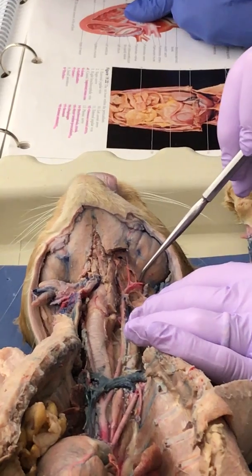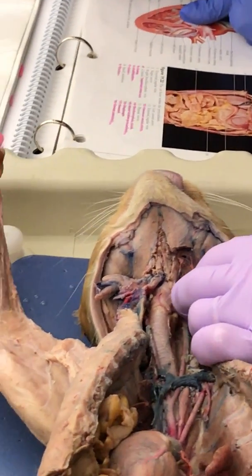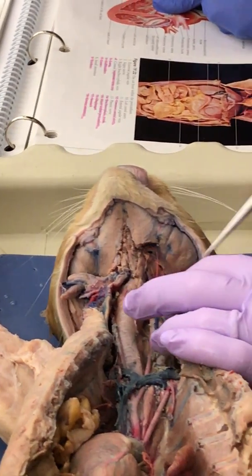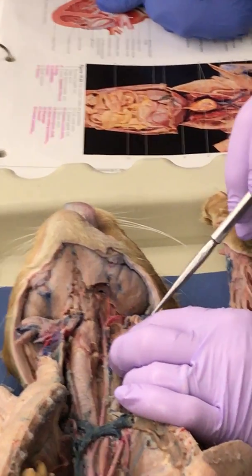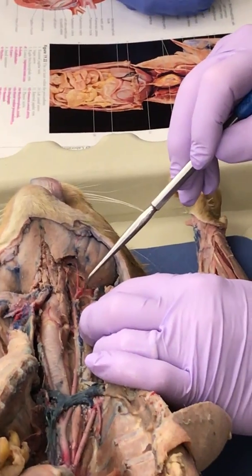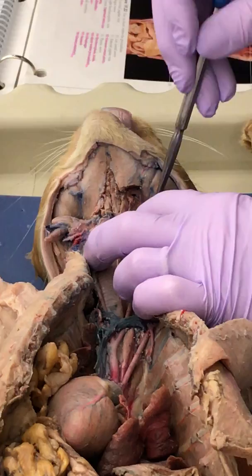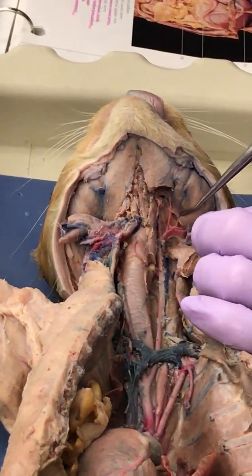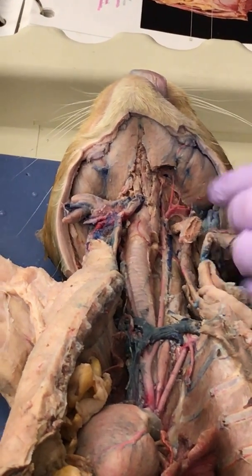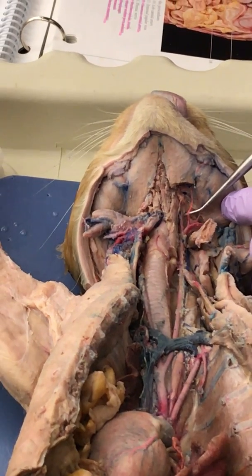Okay, so we did have a bust right there. Got one? I think it went over here. Yes? So it broke? Oh, yeah. That was connected to that. So this is the parotid gland, so that little thing right there is the parotid artery, correct? Okay, then your whopper size one, look at the size of that thing. That's the internal maxillary, and then the external maxillary. Your external maxillary is this bigger one.